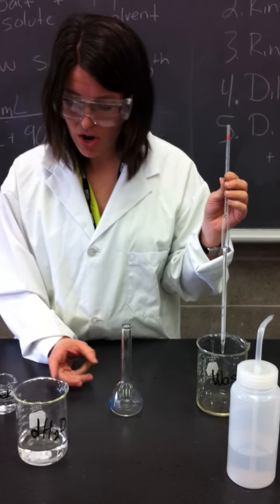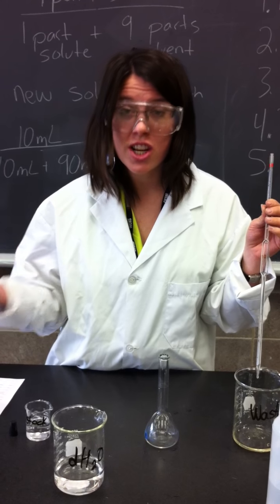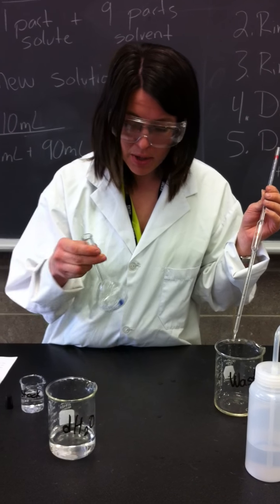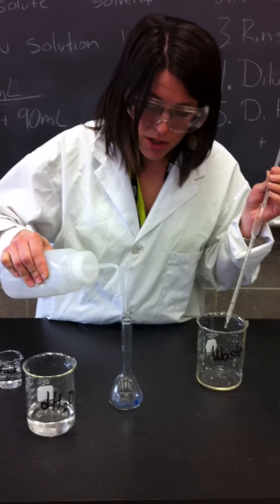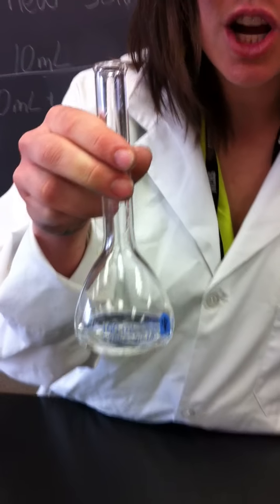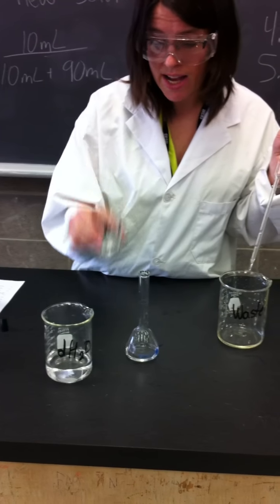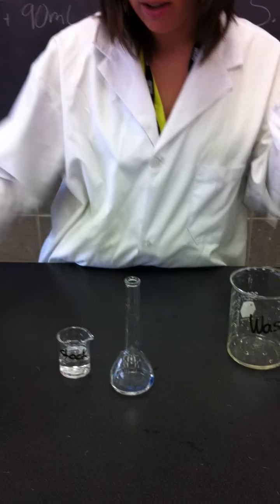Now, one of the rules regarding acids is you always put the water first and then acid on top, right? You don't want water on top of acid because it creates an exothermic reaction. But in this case, our original stock solution is pretty dilute, so we're not talking about some crazy acids here. But what I'm going to do is I'm going to fill the volumetric flask with some water first. Okay, so we've got some water in there, and then I'm going to add acid on top of that, 10 mils, and then bring it up to the line. So if I take 10 mils of my stock acid, put it into the volumetric flask, and then add my other parts to the volumetric line, I will have diluted this acid by a factor of 10.